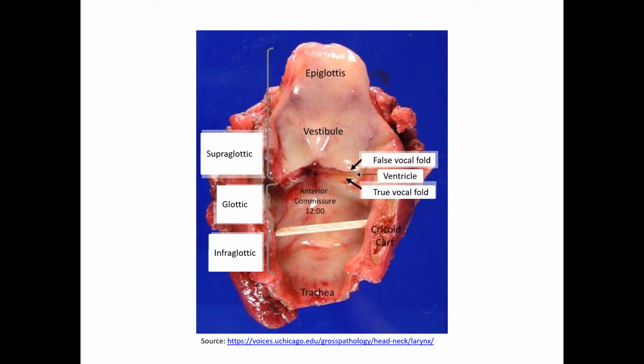So if you take a perpendicular section through that false vocal cord, ventricle, true vocal cord, I essentially get a sandwich that is pseudostratified, then squamous, then pseudostratified again, and I get lost very easily. Without the vocalis muscle, I wouldn't necessarily be able to see it. Even if I do see vocalis, I'm not 100% sure half the time that it is vocalis muscle. So in theory, you could, but in practice, probably not so much.